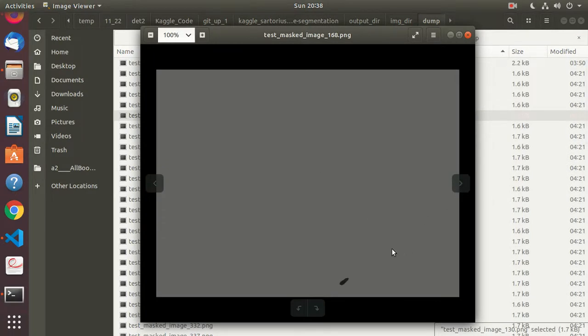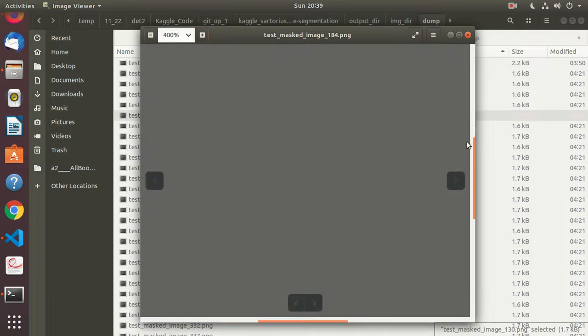So this is a binary mask. You see at this bottom over here, this is a mask of a cell. It is from this very dataset from Sartorius, and similarly, this is another cell. This is another cell, and if you zoom in, there is nothing much. There is just a mask, and I've converted this mask to look like this. The background is slightly gray, and this cell is very dark.